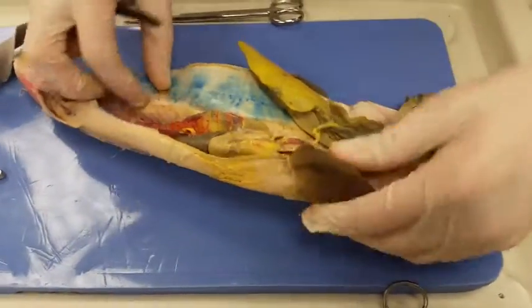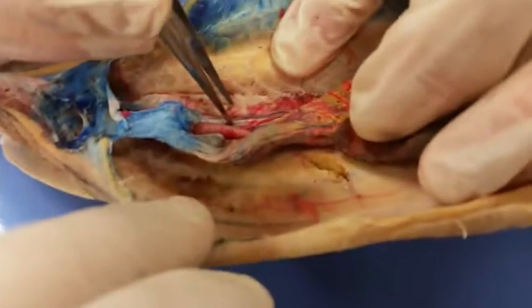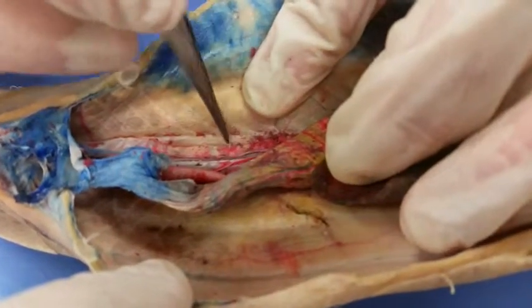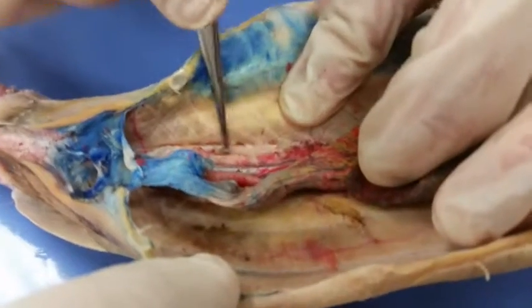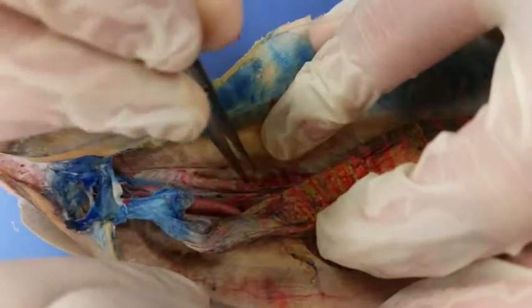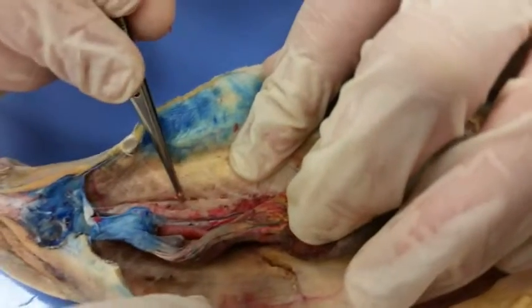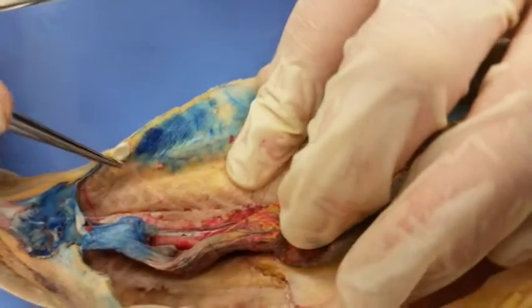And on to urogenital systems. We have down here the kidney. It's kind of difficult to see, but we ran the scalpel right underneath there, so you can see the kidney right through there. And then right next to the kidney, pretty tough to see in ours, there should be an accessory urinary duct.